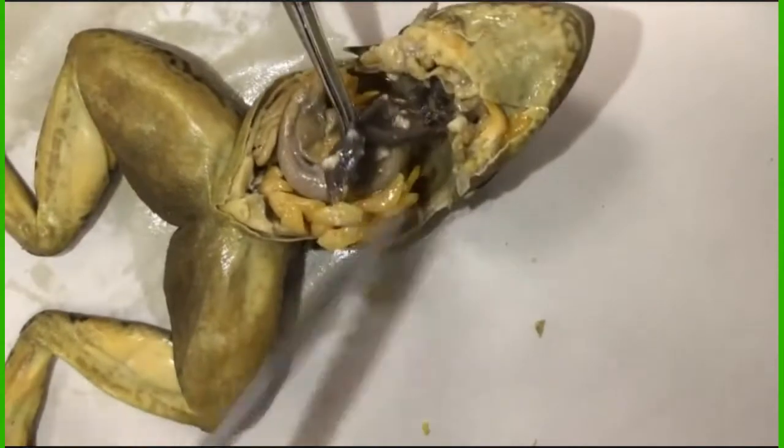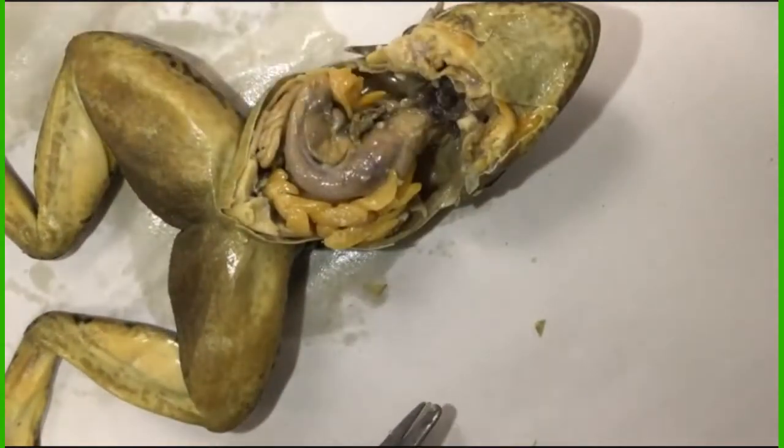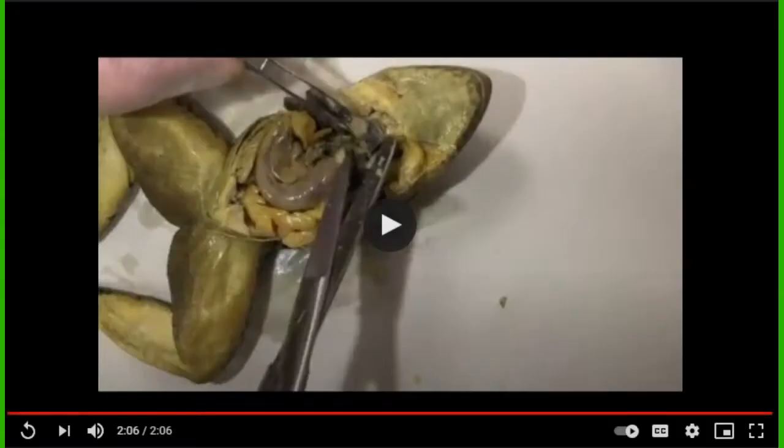And with my students, when we're doing this in class, we'd have a paper, and I'll show you the paper in a little while, where you're laying the organs on the paper. The paper is labeled, so you're just putting the organs down where they're supposed to go on that paper.